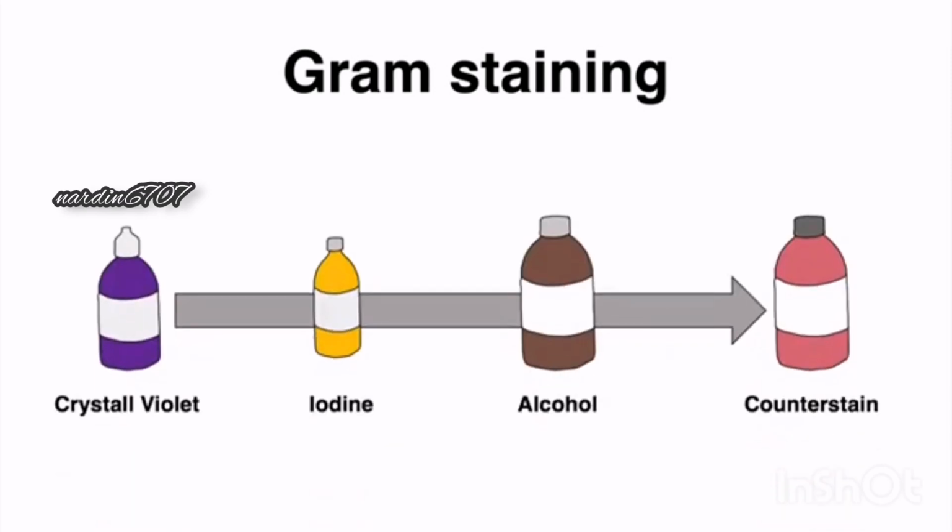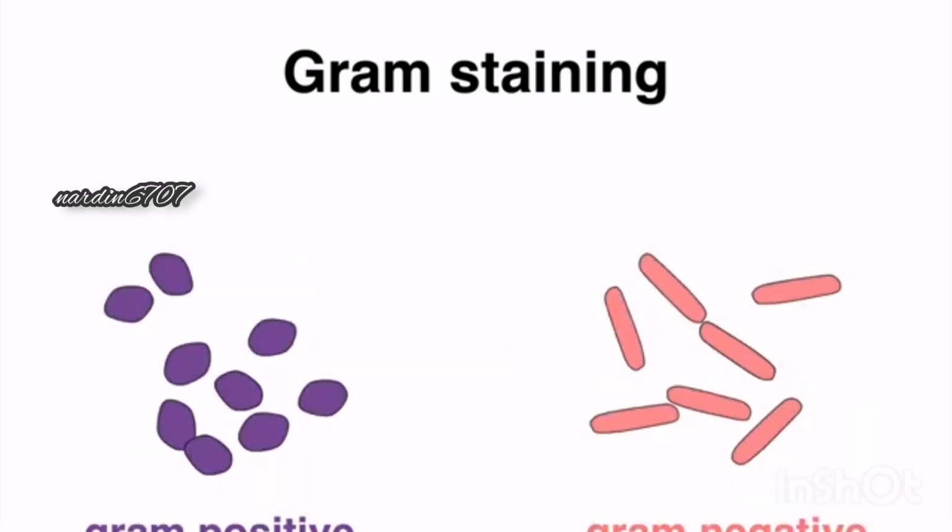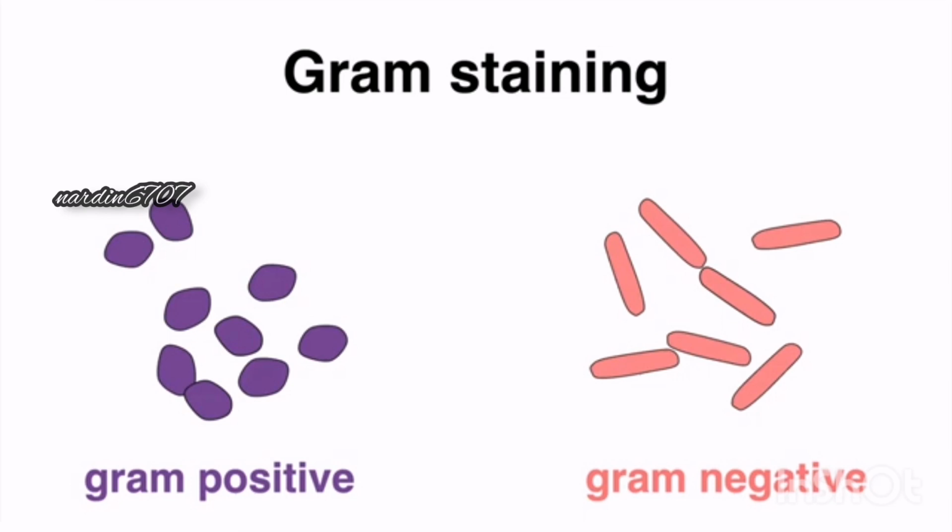Gram staining was published in 1884 and is based on a sequence of chemicals, starting with using crystal violet followed by an iodine treatment, washed out with alcohol, and finally counterstained. This procedure leads to gram-positives appearing purple and gram-negatives red or pink.